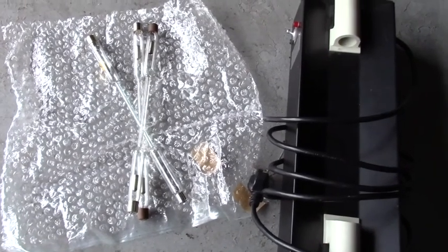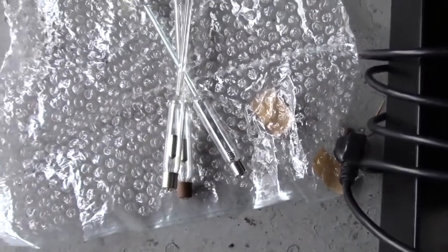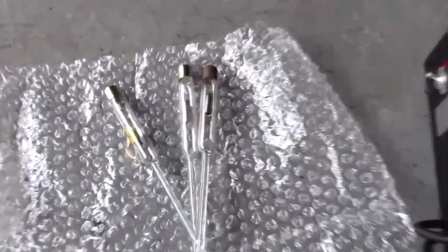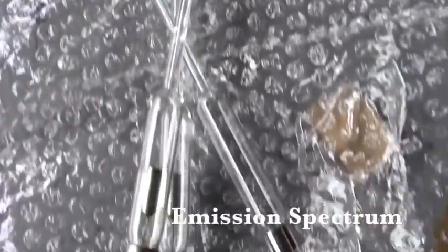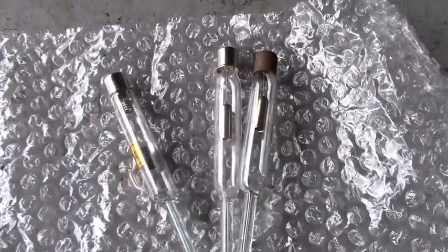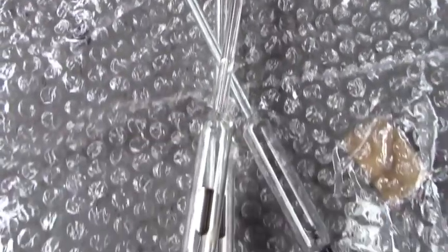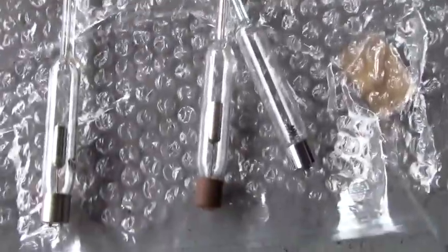Welcome back to another segment of Seneca Chemica, where we look at simple demonstrations and experiments for general-level high school chemistry or very basic college chemistry. Today we're going to look at emission spectrum. The easiest way to do that is with spectral tubes — long glass tubes like a fluorescent light bulb, but inside there are vapors of different elements. For example, this one is hydrogen and this one is helium.